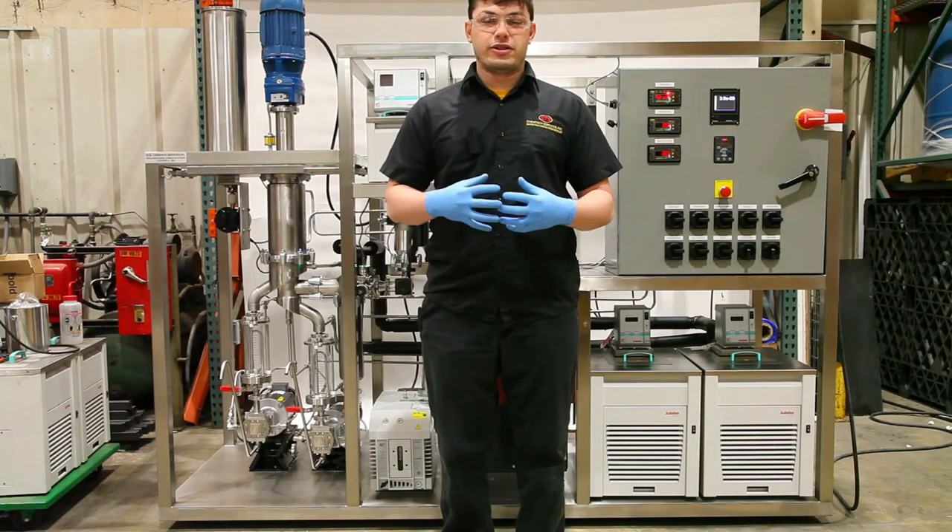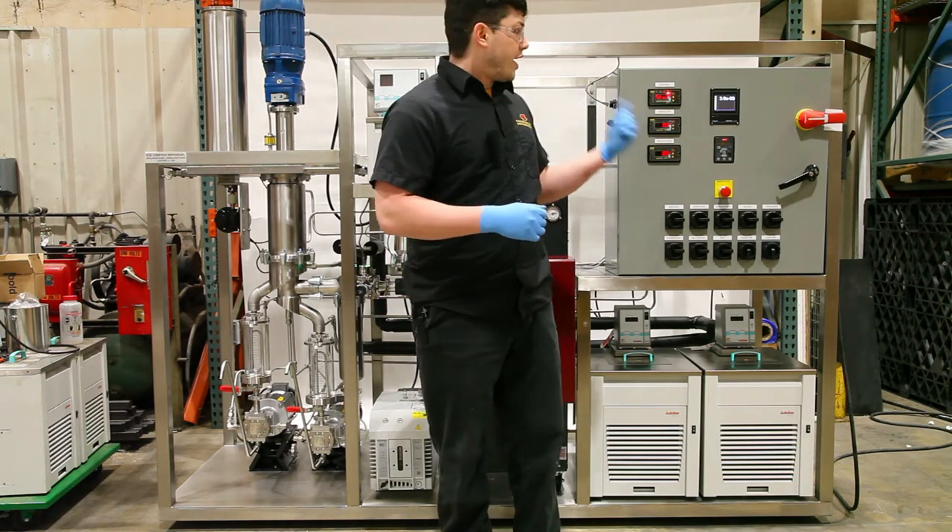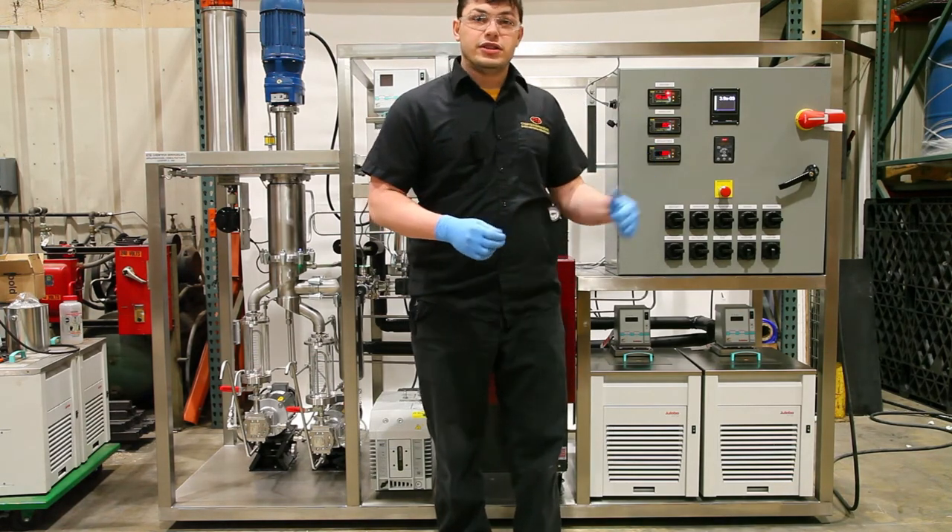Once your turbo molecular pump is fully started up and your vacuum is to the desired level, you can start your feed.